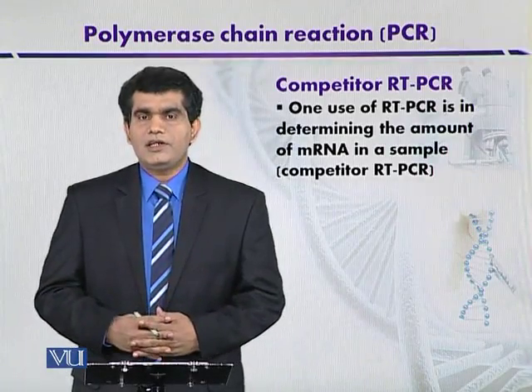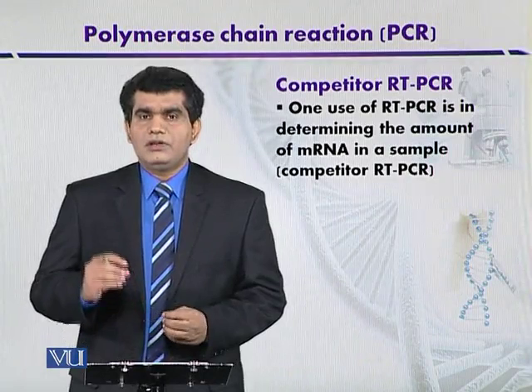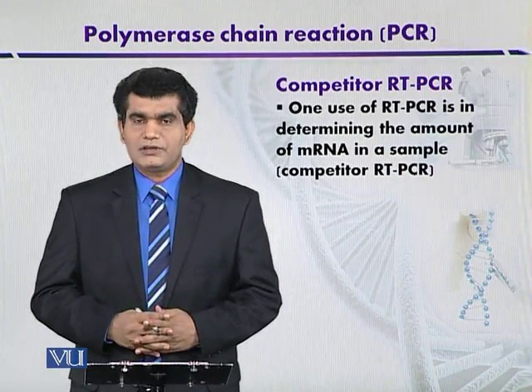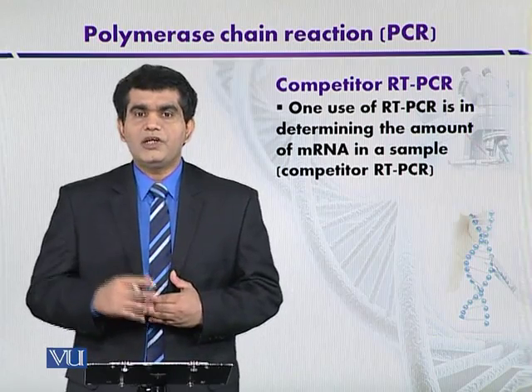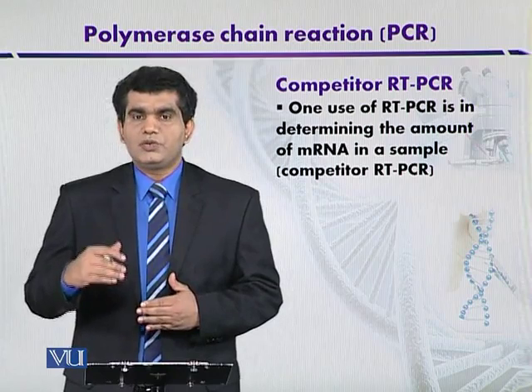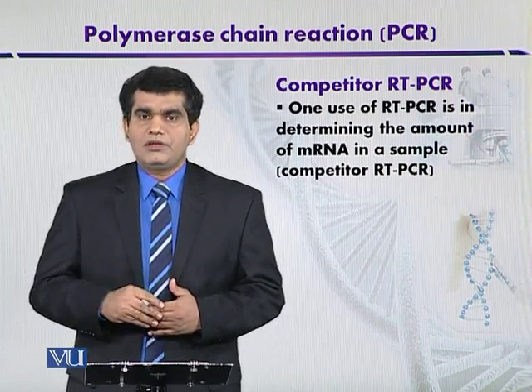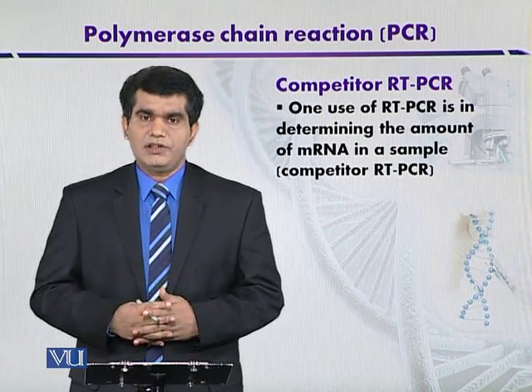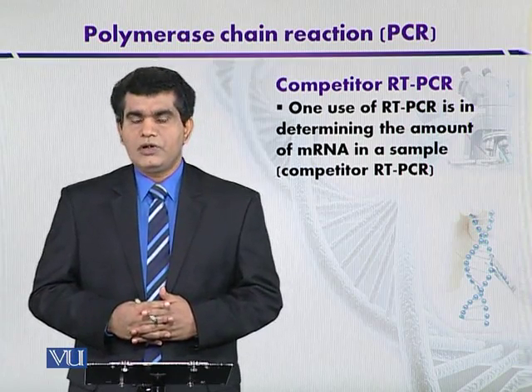competitor RT-PCR. This is also one of the variant of RT-PCR. अब ये किस मकसद के लिए यूज़ किया जाता है? इसको मेनली यूज़ किया जाता है to quantify the messenger RNA or even the cDNA in the tissues.